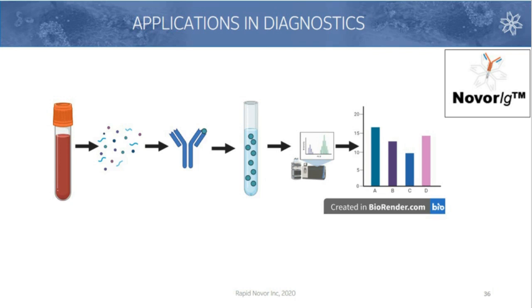Similarly, developing these kinds of assays using mass spec can yield high levels of sensitivity while not having to dig too deep into that patient of interest with respect to pulling out bone marrow or some kind of other material which has the genetic components that you're looking to do a high sensitivity assay on.